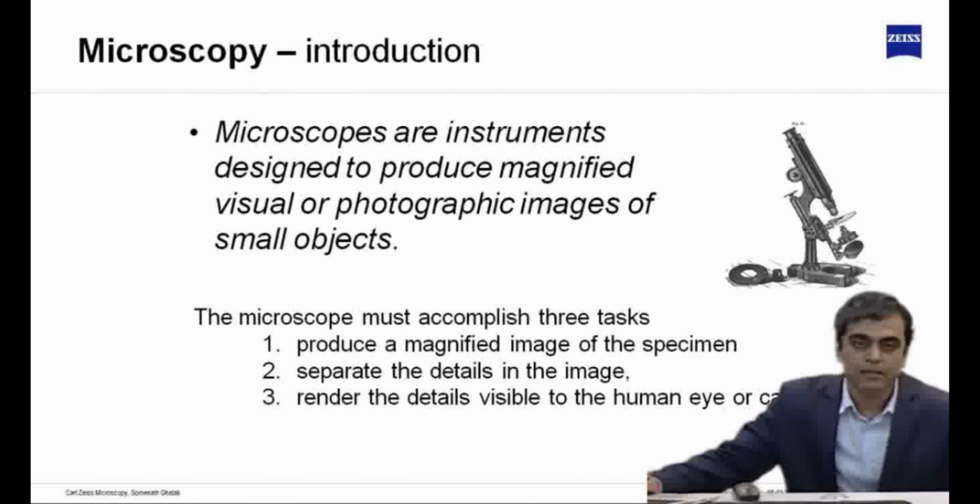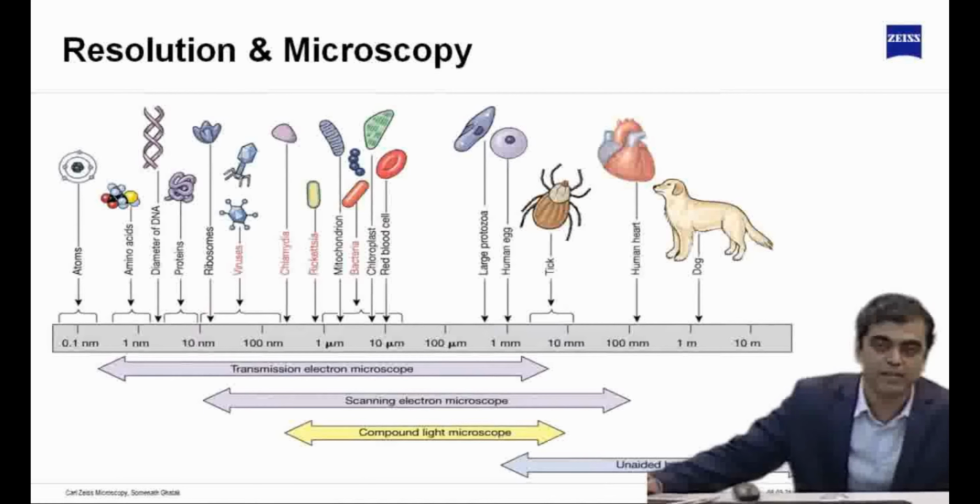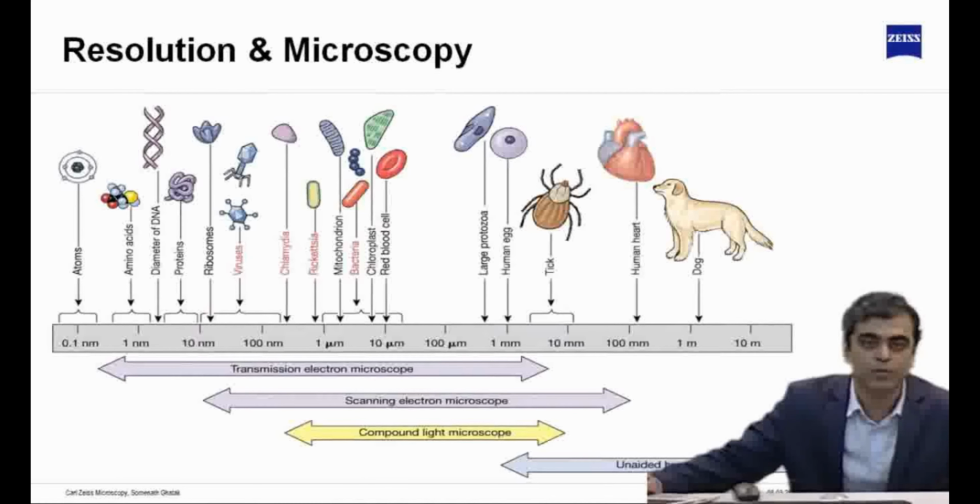Now, the basic objective of the microscope is to see or to magnify what is sub-resolved to human eyes. People have already started having curiosity to explore and understand those sub-resolved items.